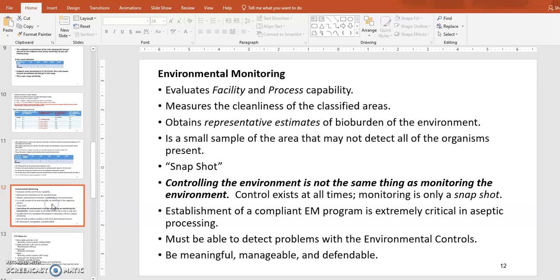Okay, and then the next part of the lab, we're going to deal with environmental monitoring. Again, some of you have done this lab in the previous class. If that's the case, you can help your partner, all right, who haven't done it. So environmental monitoring, when you say that, it means it's a kind of assay that takes place in your manufacturing process or manufacturing space.